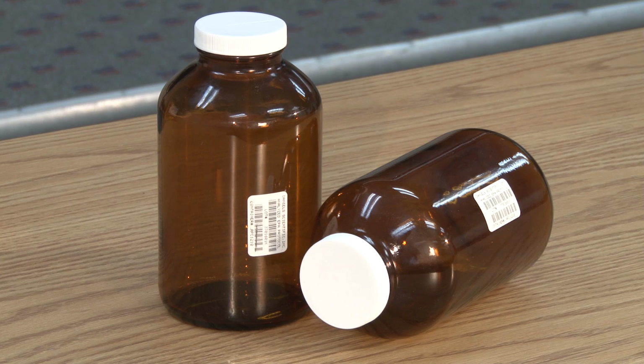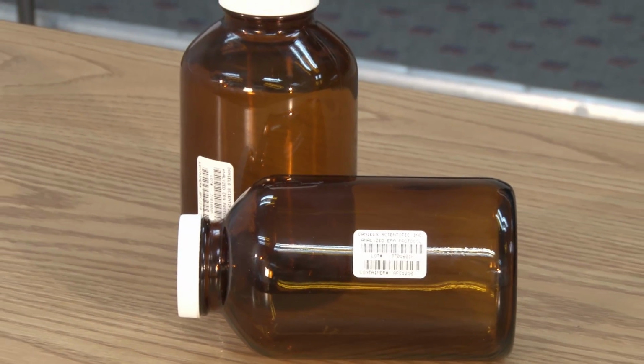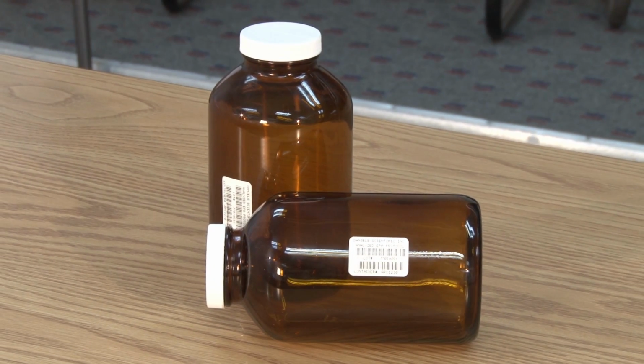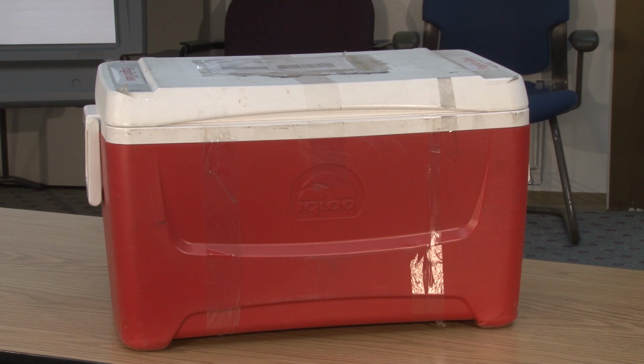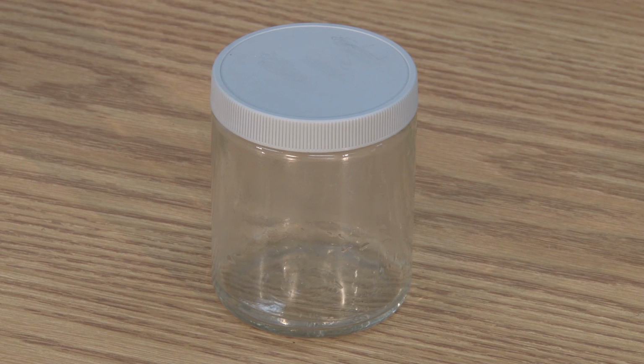The sample containers are bottles in which the samples are deposited for shipment to the laboratory. These may come from the laboratory that has been contracted to perform the analysis on your samples or purchased from your lab equipment supplier. You will need a high-impact plastic cooler, which may also serve as the shipping container to off-site laboratories. Certain sample containers may include a small amount of preservative liquid.